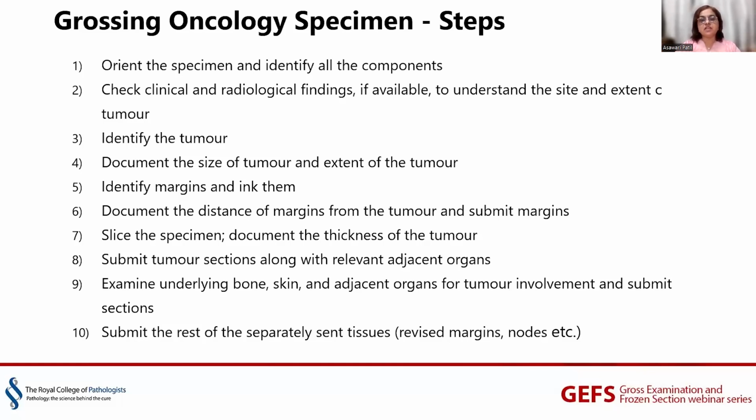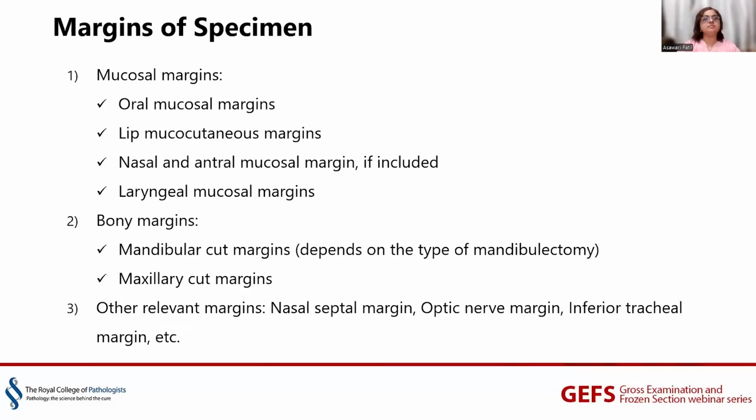So if that section key is there, anyone who is looking at the microscopy can identify exactly where the section is coming from. This is especially true for big hospitals or big laboratories, when the person who is grossing the specimen may not be there while the case is being signed out. So the section key is very important in that case.